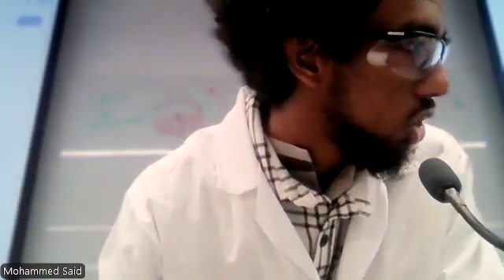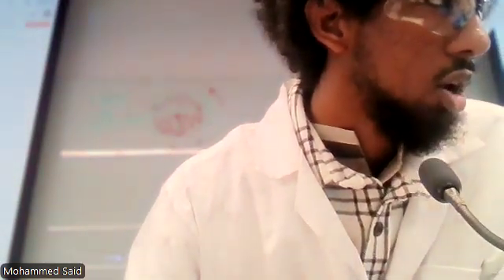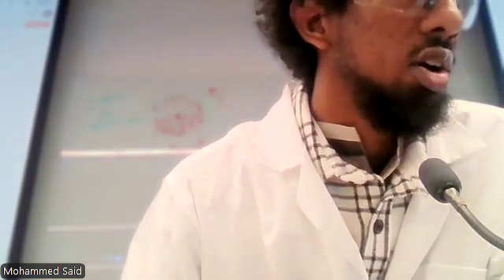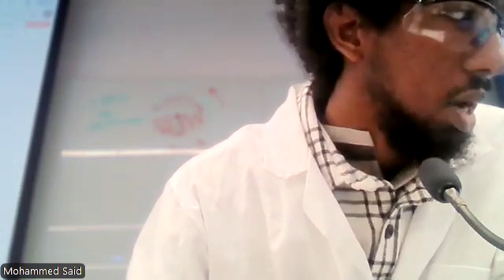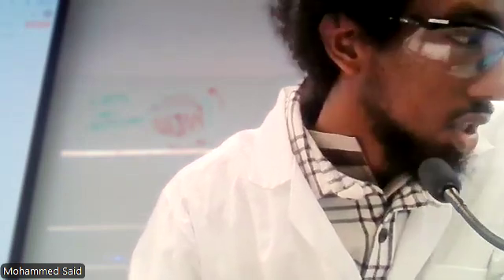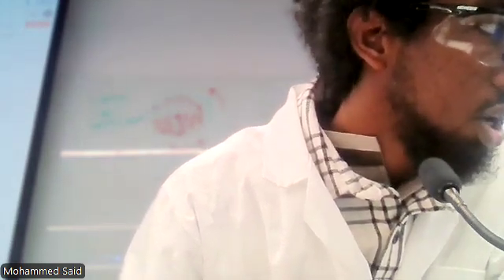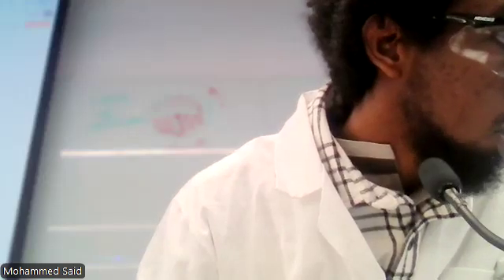Back to the upcoming group's questions. So there's a question about conjugation and how you're essentially going to use the sterile swab. It's shown here as a one-drop method. It's specified also in the manual. But the idea is for each bacterium, and please pay attention to this because it's different for all 3 plates. The first 2 are done the same with a one drop.